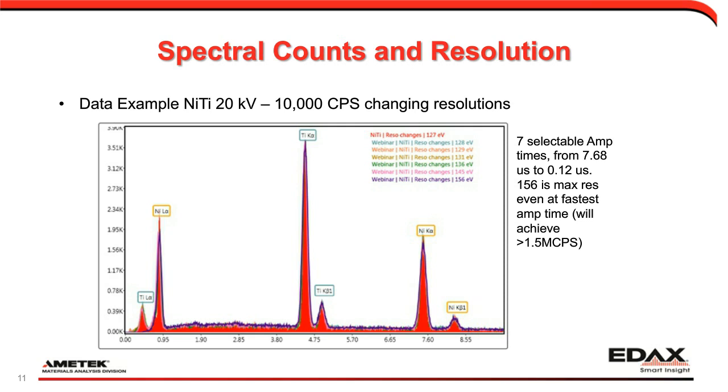And so now we'll look at all of those amp times, that spectra, in terms of quantitative results. So the visual was just the qualitative, and now we'll look at the quantitative results.